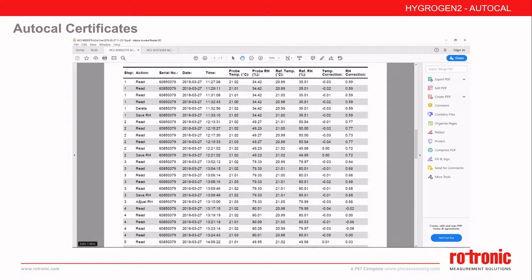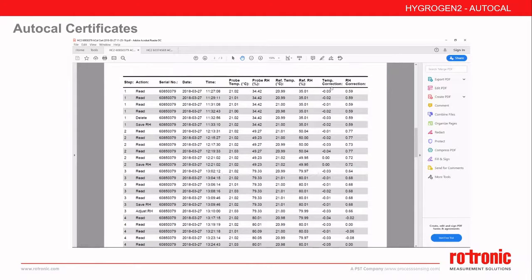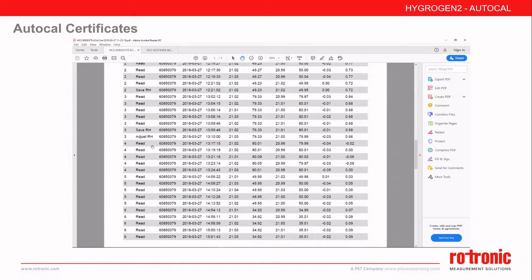At this point the probe is adjusted. We can see that the temperature correction is very minimal, but at especially all points there is over 0.5 RH correction. Once adjusted, the points are repeated, and we can see that this humidity correction has reduced dramatically as the probe has been corrected against that reference.